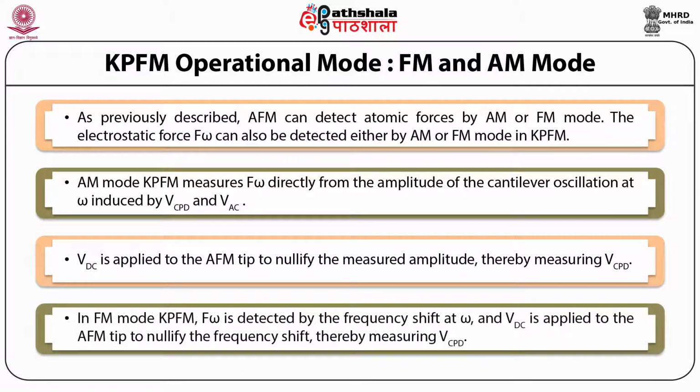In FM mode KPFM, the force is detected by frequency shift at omega and potential DC is applied to the AFM tip to nullify the frequency shift, thereby measuring this potential CPD.